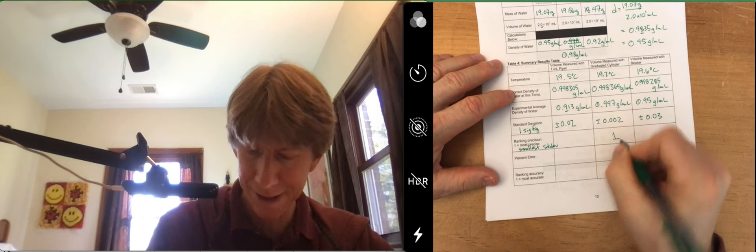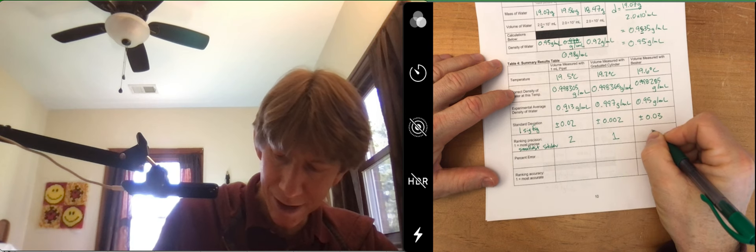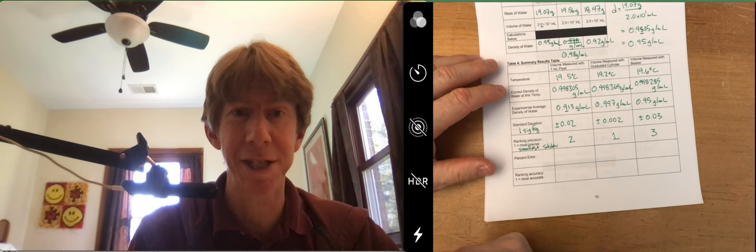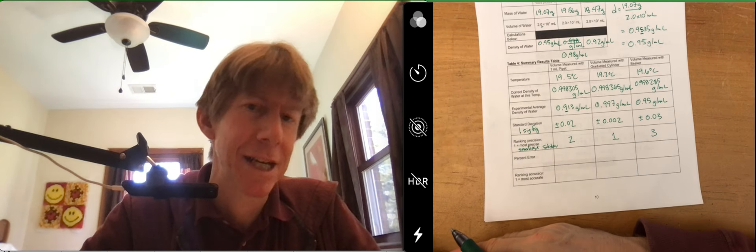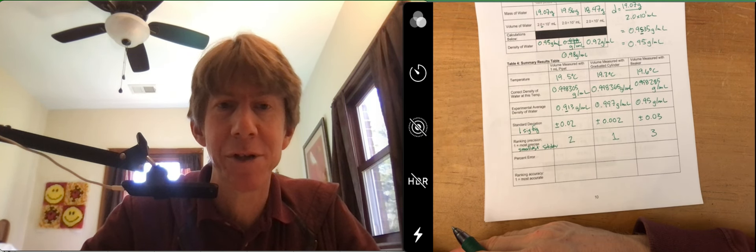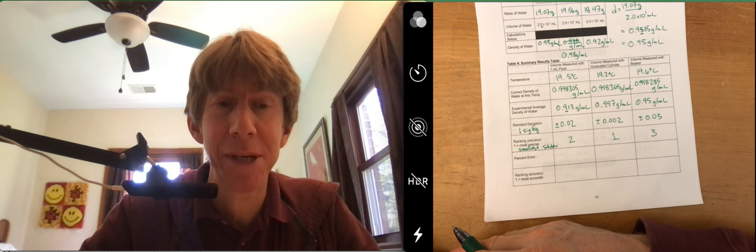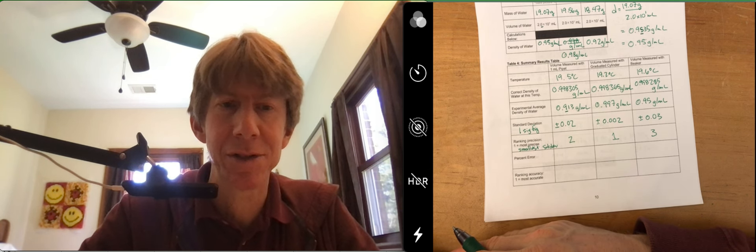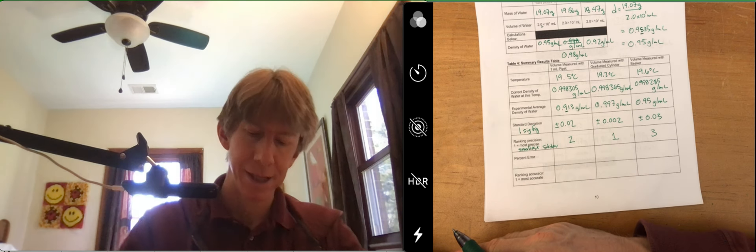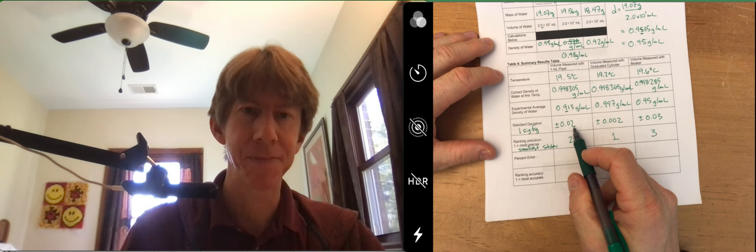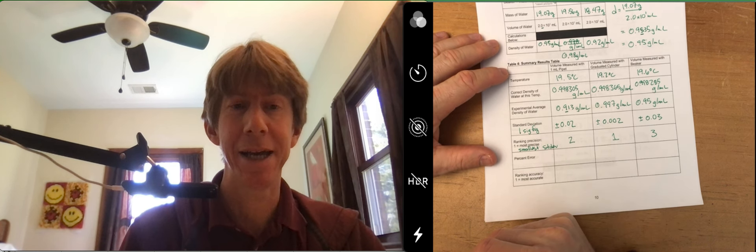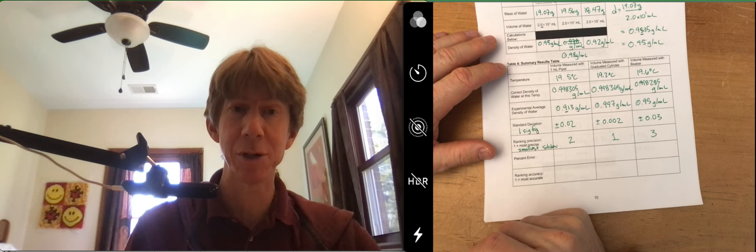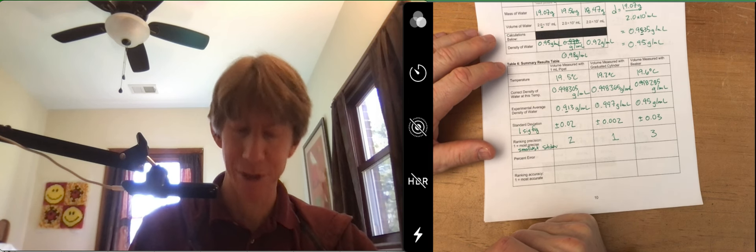Then our next precise, and then our least precise. And that's not surprising. The beakers are oftentimes the least precise. That's why we almost never actually measure anything for a reaction in a beaker. We use beakers to hold chemicals, not to measure them. And the pipette, as I mentioned, is actually pretty precise, and we are going to do a whole other lab to make it the most precise possible in lab two.